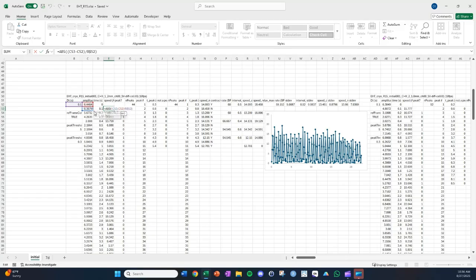So speed is a change in position. So this is position 1, position 2, over the change in time 1, time 2. Perhaps more precisely, the time point associated with the speed would be at 0.05 seconds, somewhere in between, since I'm taking these two speed values.